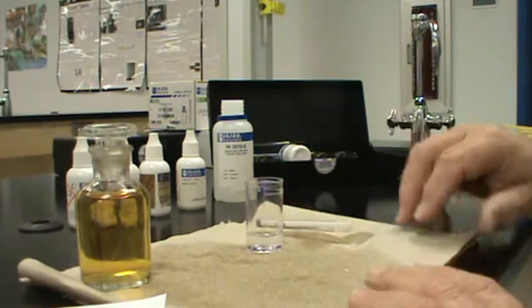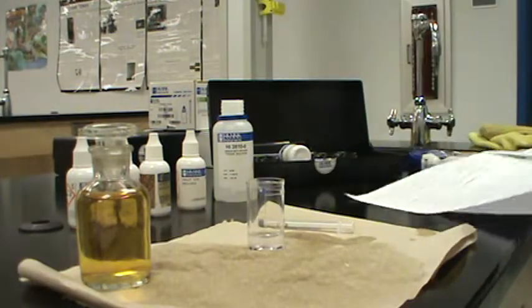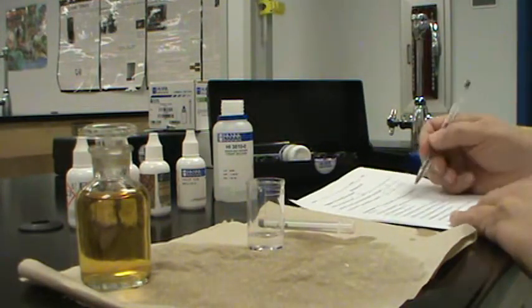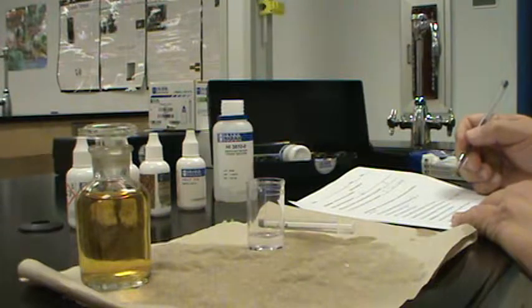So, 16 drops for our dissolved oxygen. So our questions were, did we get a precipitate? Yes. Did the precipitate dissolve? Yes. Did it turn yellow? Yes. How many milliliters did we use?